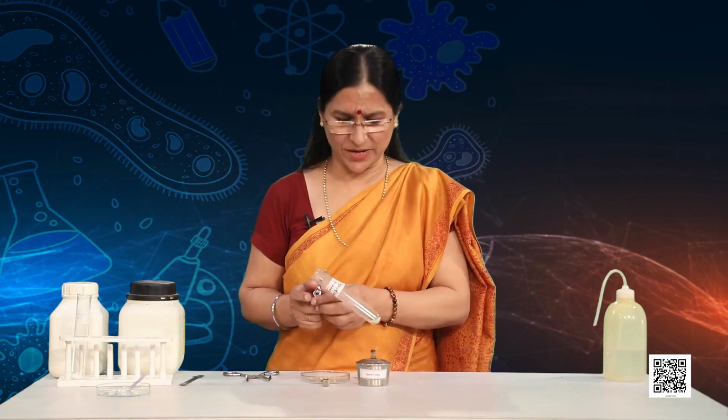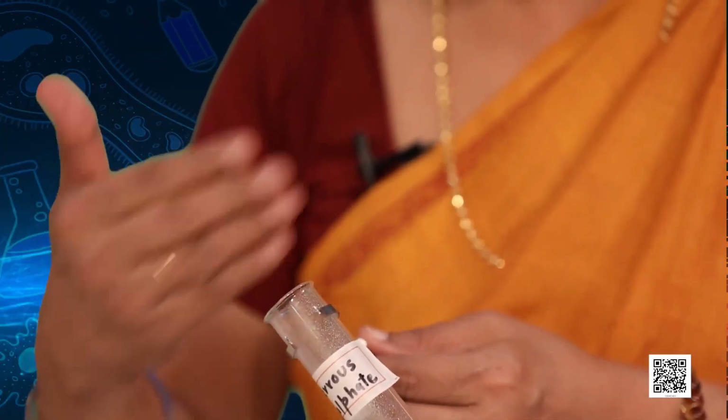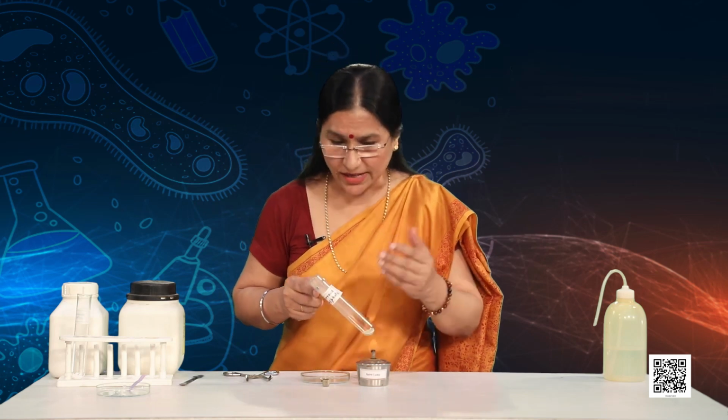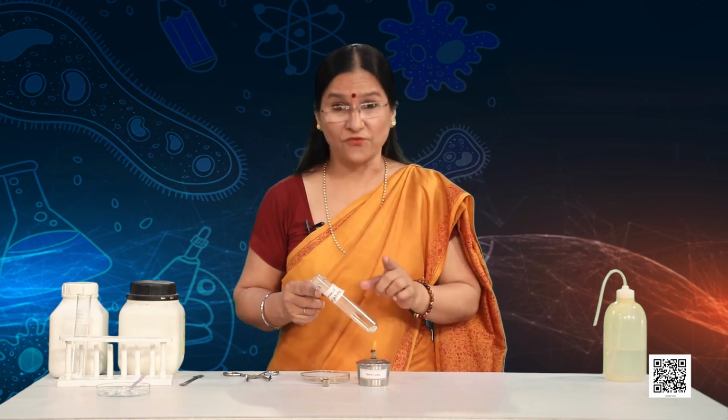We can also smell characteristic odor, and the correct way is wafting gas gently towards the nose. Never inhale the gas directly. It may be harmful to you. And can you hear the crackling sound? Aha! The reactant ferrous sulfate is breaking down.